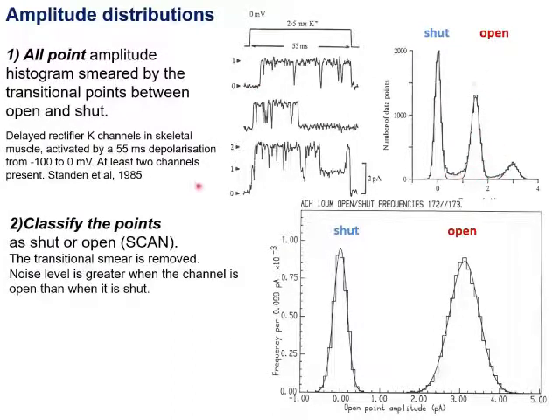If you want to have a prettier picture, and it depends on what the purpose of your measurement is, you can actually go one further. You can fit the opening and the closing of the channel with the time course that you would expect given the particular filtering that you're using.